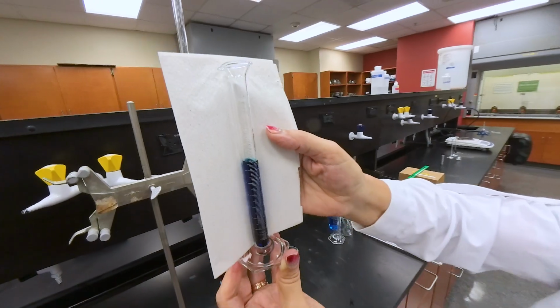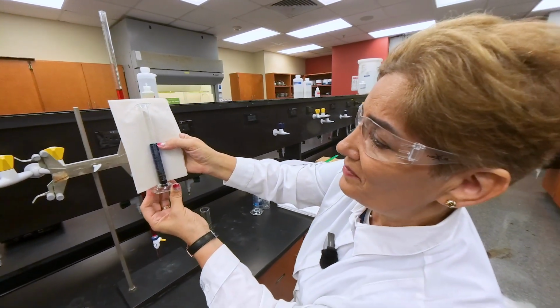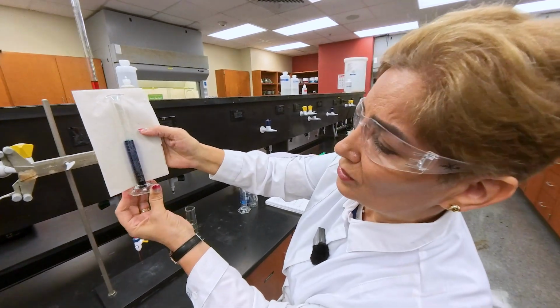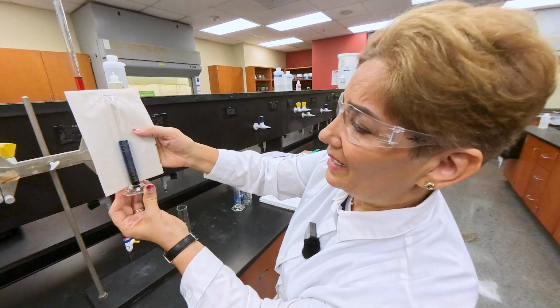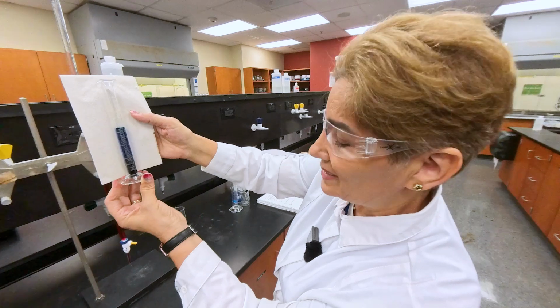There are 2 digits that I'm going to record here. Those are certain digits. That would be 7.5. And since it's between 7.5 and 7.6, you have to look closely at this level and estimate the last digit, which is going to be between 7.5 and 7.6.